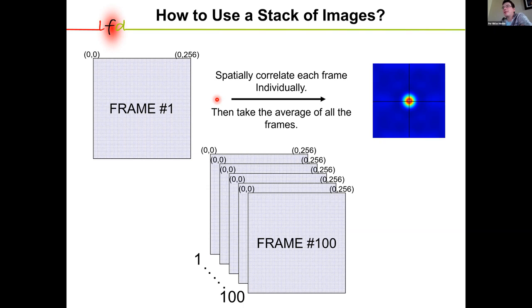Taking more than one frame also has other advantages. For example, we can, to a certain extent, correct for bleaching and also subtract the immobile fraction, which I'll talk about in a minute.